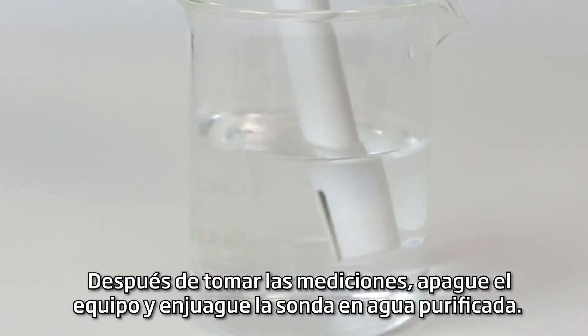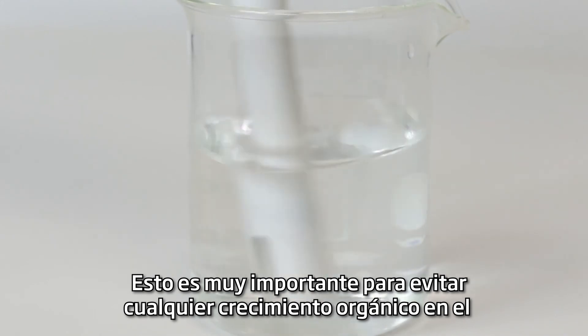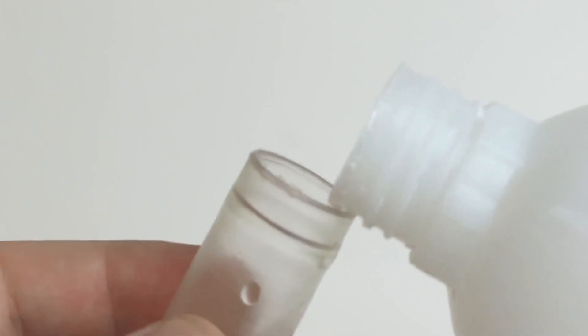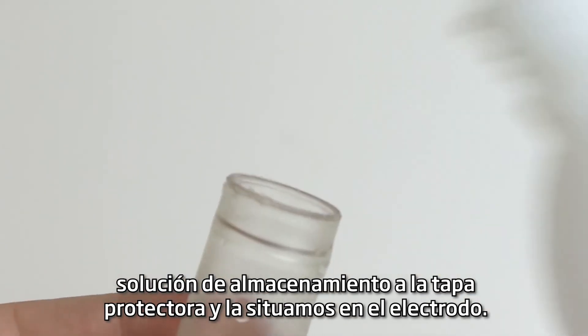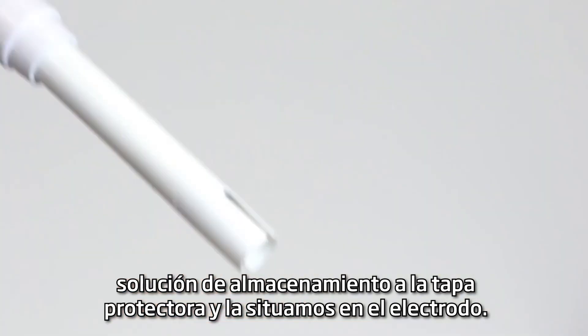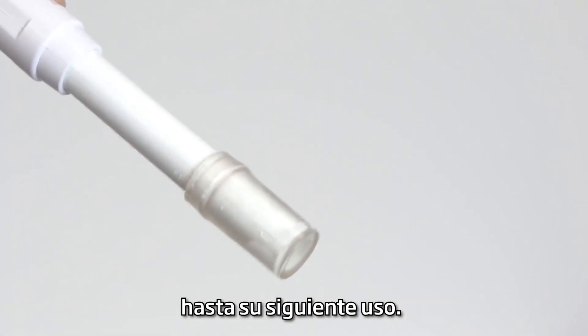After taking measurements, turn the meter off and rinse the probe with purified water. This is very important to prevent any biological growth on the glass of the pH probe. Once the probe is rinsed, add a small amount of storage solution to the protective cap and place it over the probe. The storage solution will ensure that the pH probe stays hydrated until the next use.